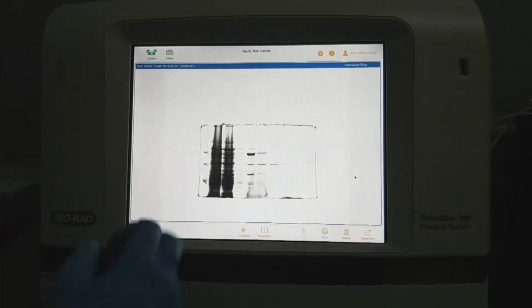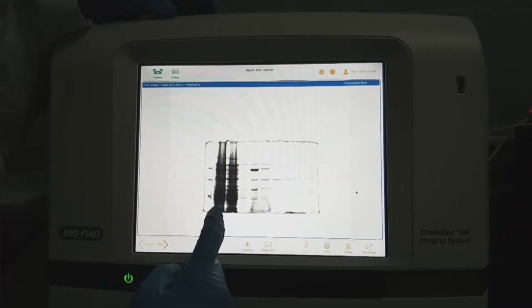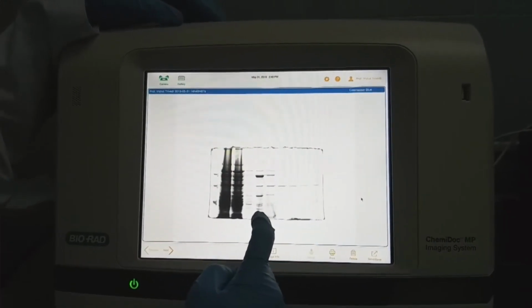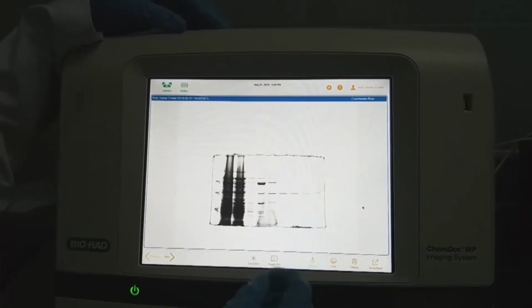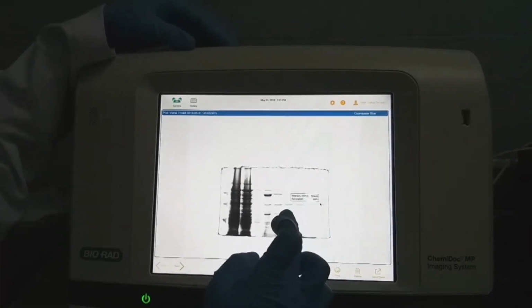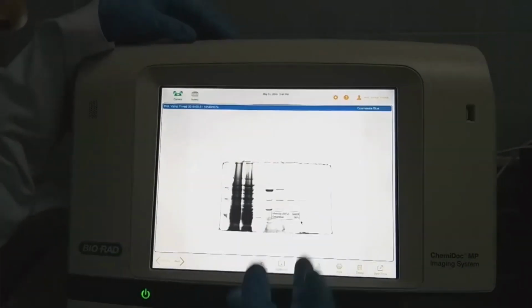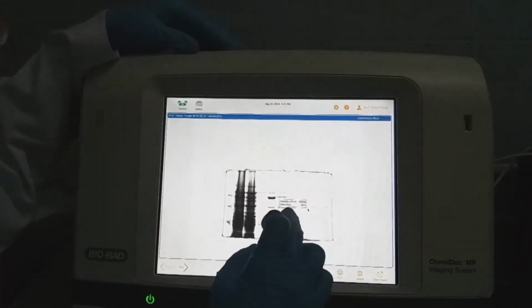So we have loaded the marker from this side. The second one is the load. This is the flow through, wash 1, wash 2, and these are the eluted fractions 1, 2, 3, 4, 5 serially. As we can see, the eluted fraction shows a band corresponding to this protein, but the molecular weight can be calculated using the Image Lab software.